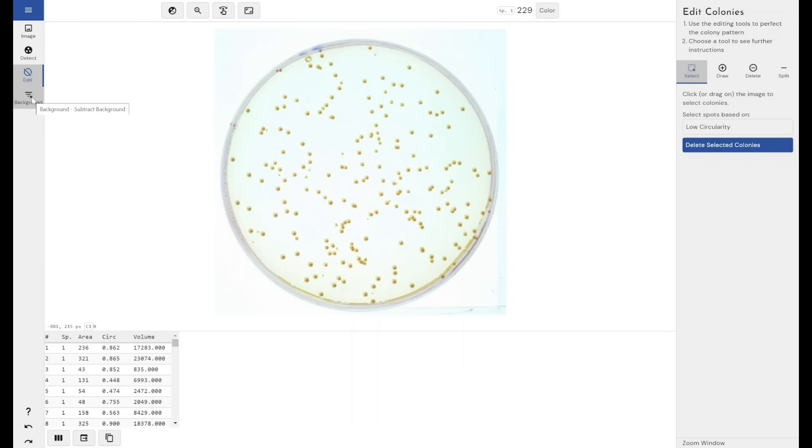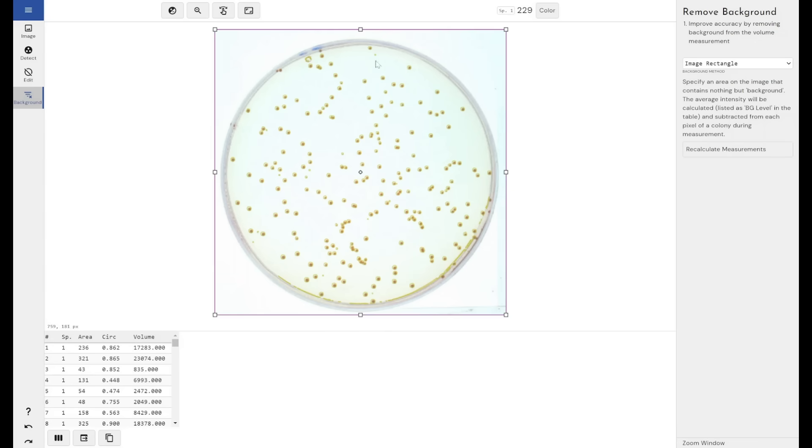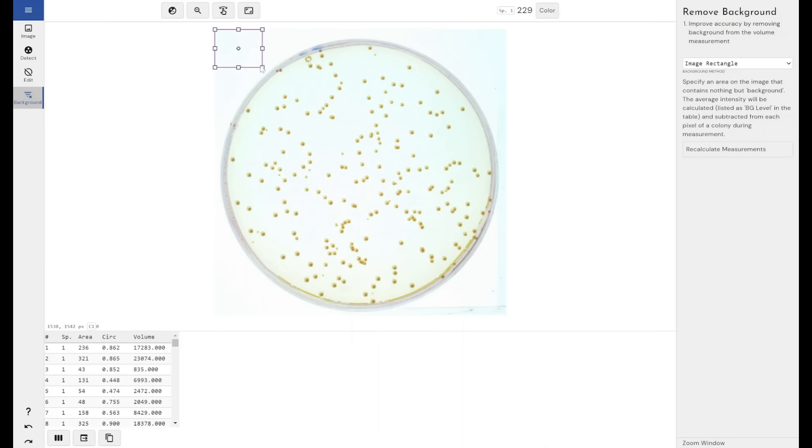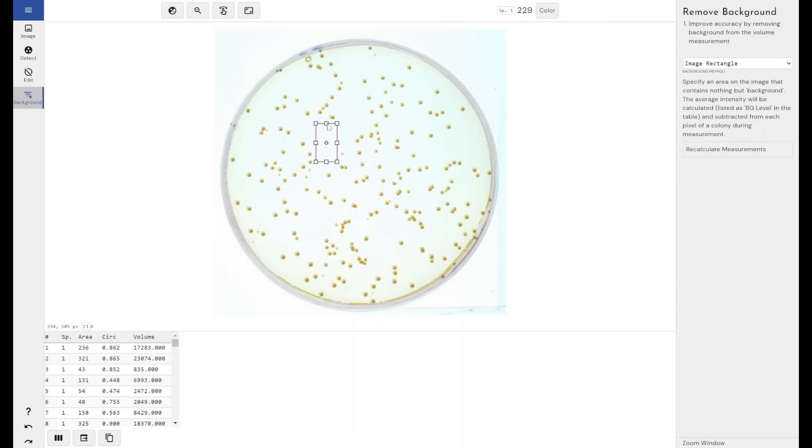In terms of background removal, the next step, we have two methods of background removal. We have the image rectangle. If you've used 1D image analysis software before, you'll probably recognize the image rectangle as being a fairly standard method for background removal, certainly in 1D gels and western blots.